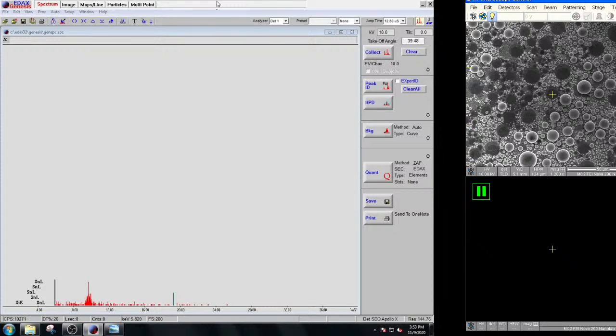All right, so we talked about two problems there. Remember, the CCD camera has to be paused. And remember, you've got to be in mode 3 to do EDS analysis. Now, you also can do this in mode 2, and we'll get into that when we get into the maps. That's really useful for doing high-resolution maps. But do keep in mind that mode 2 also works.